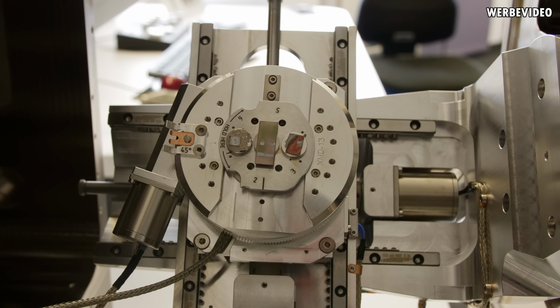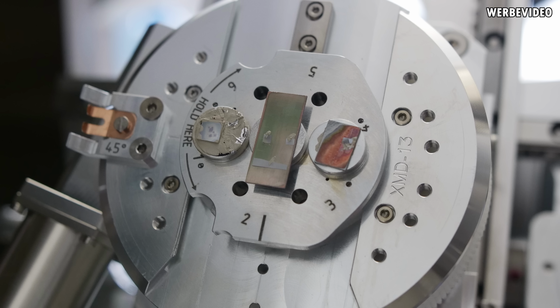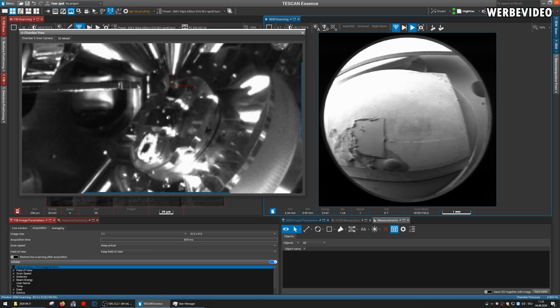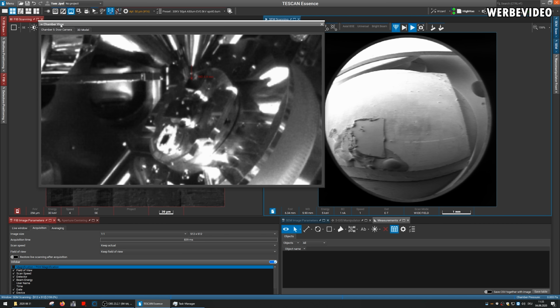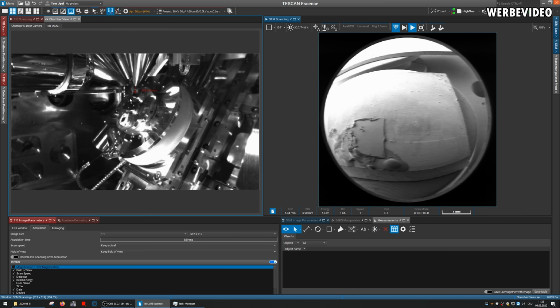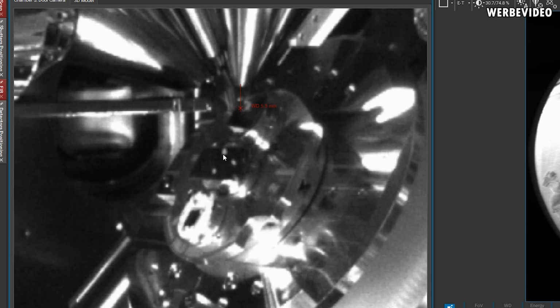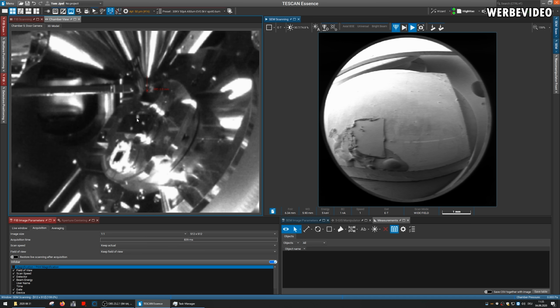The CPU is now sitting inside the scanning electron microscope, and the goal is that we cut a very thin fin out of the chip to have electrons running through this very tiny part so we can see through it and see the transistors. I'm just going to show the process with the 7 nanometer TSMC or AMD CPU. We of course did the same process with a 14 nanometer 10900K CPU, but the process is exactly the same. That's why I'm just going to show the AMD part right here.